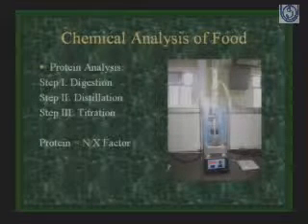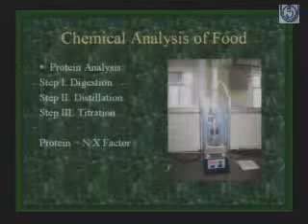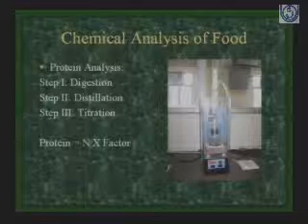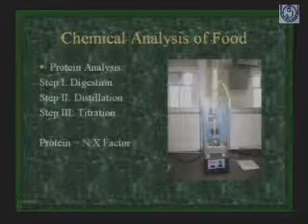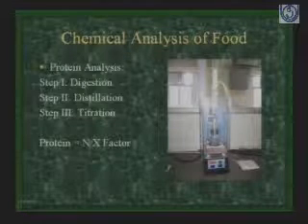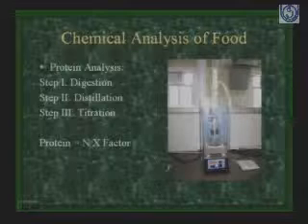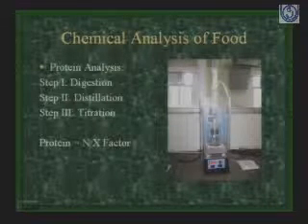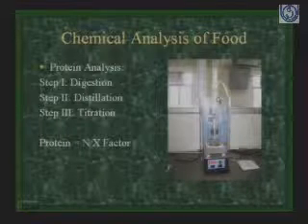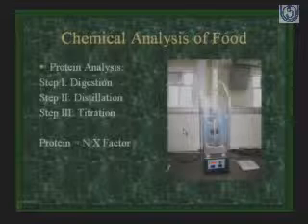And protein is basically analyzed once you take out the nitrogen and then you calculate on the basis of a particular factor. So here we see the product is crushed into powder, put into the flask, hydrogen peroxide is added and heated up to 450 degrees centigrade, and the sample is digested, and all the hazardous organic matter goes through this condenser and passes through the drain.